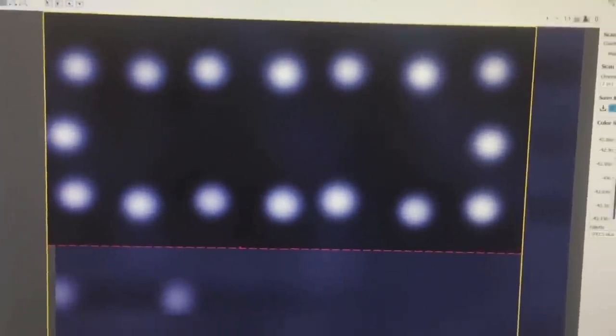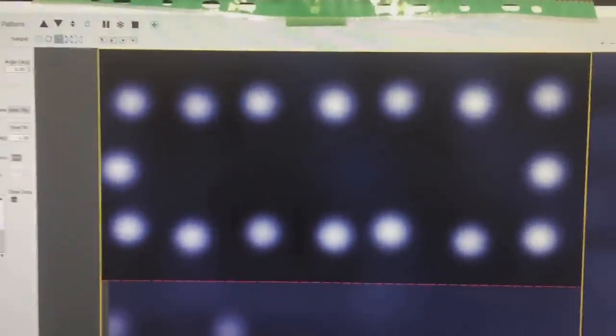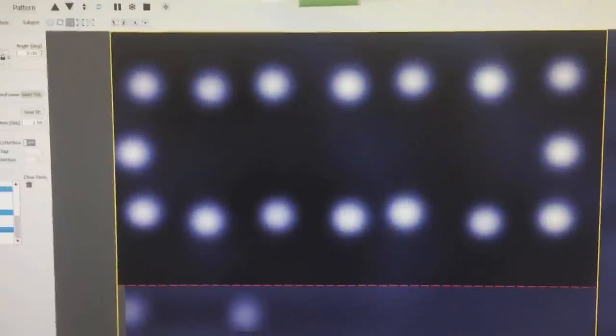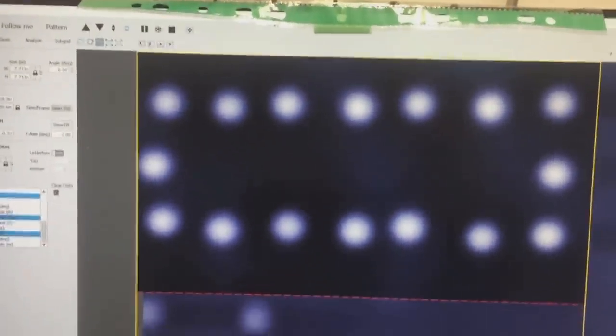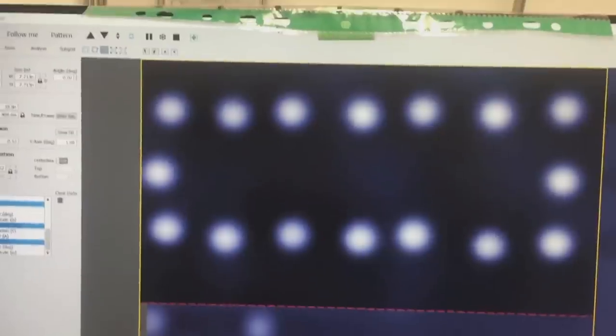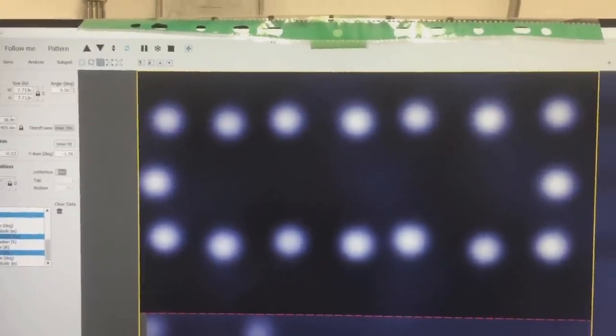So, this is a little rectangle of atoms. Each gold atom pushed in place. Before and after, hopefully, will appear on the screen. Each blob there, each circle, is a single gold atom, and what I'm hoping is that we can find some electrons within that little container. It probably needs to be compacted a little bit more and the atoms moved together a little bit more, but it's getting there.